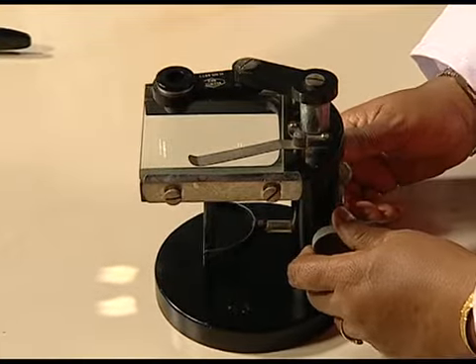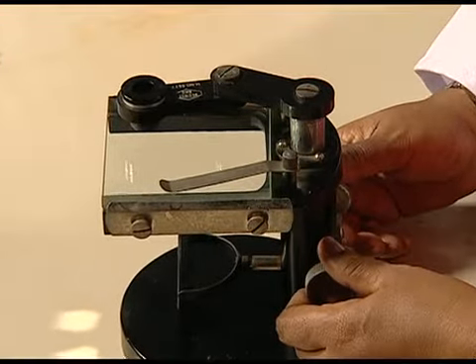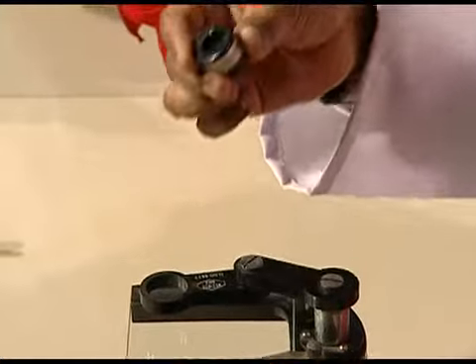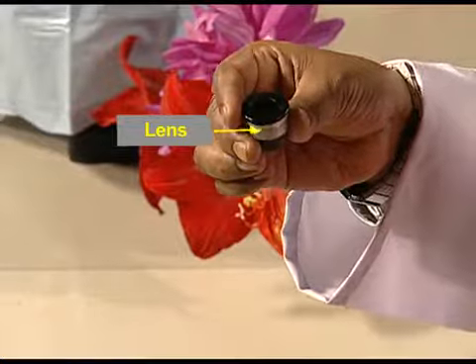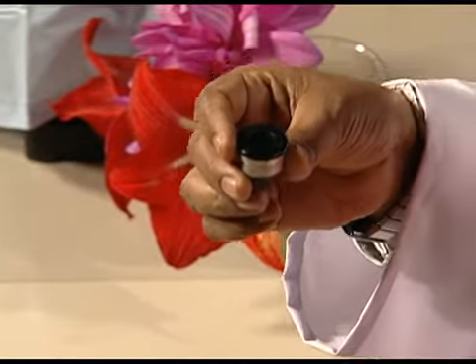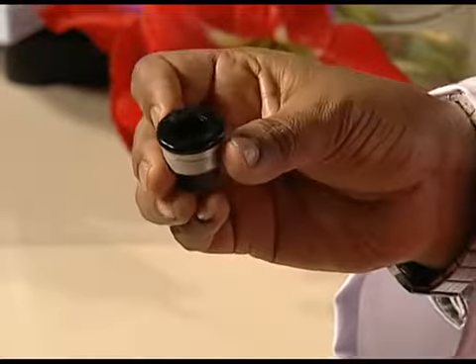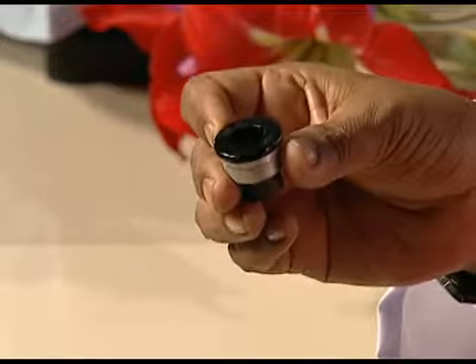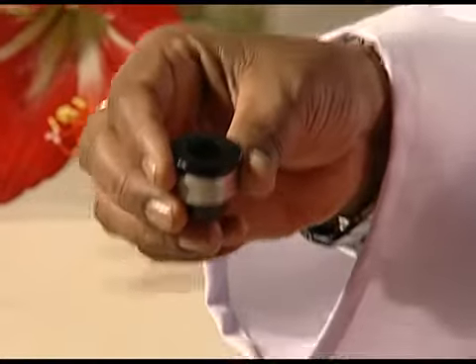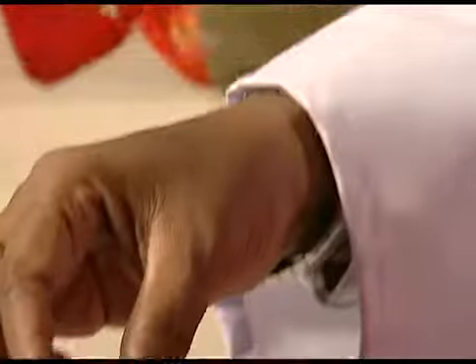Let us see the different parts of a dissecting microscope. It has a lens to magnify the image of an object up to 5 to 10 to 20 times. This lens has 10x magnification power. X denotes the number of times a lens can magnify the image of an object.